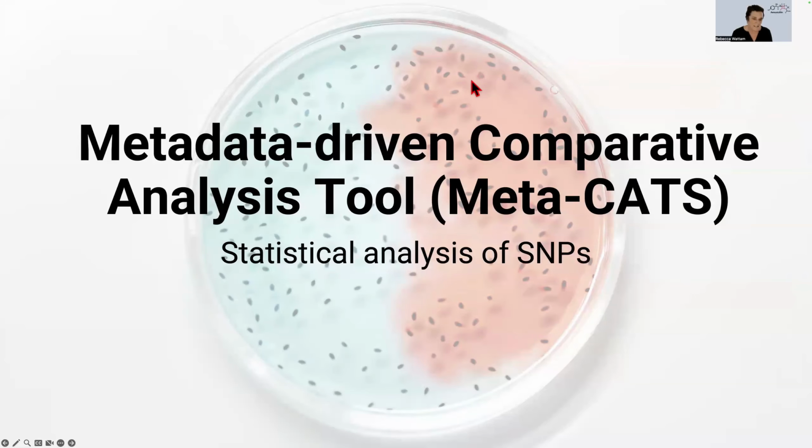Once you've done an analysis like a multiple sequence alignment, and you can see that there are differences between two groups, and in this case, it would be those proteins that are from isolates that are susceptible or resistant to a particular antibiotic. How do you know if those results are significant statistically that you could use in a publication? Well, BV-BRC has a tool that you can use that will show you that, and it's called MetaCats, which stands for Metadata-Driven Comparative Analysis Tool. And that's what we're going to talk about right now.